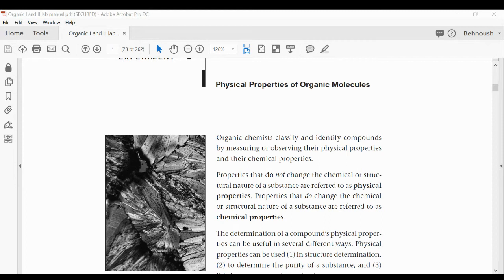If you look at a similar concept, using fingerprints, how do you identify the person? You would look at a table. You look at the table with the melting points of known samples, or you can check against a database. The database, we have books called the CRC.